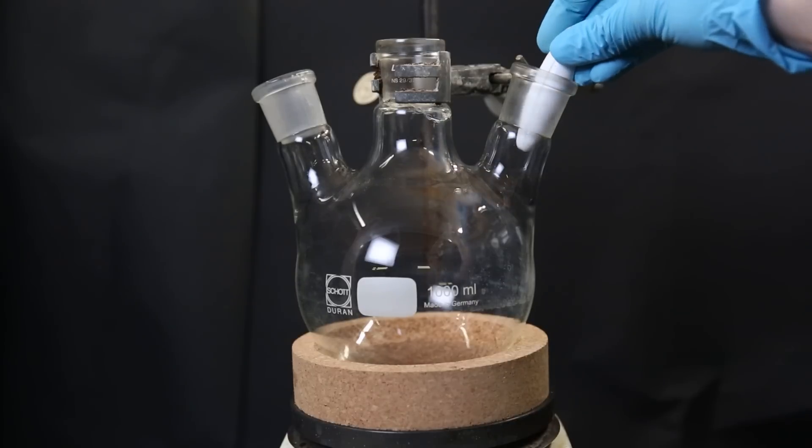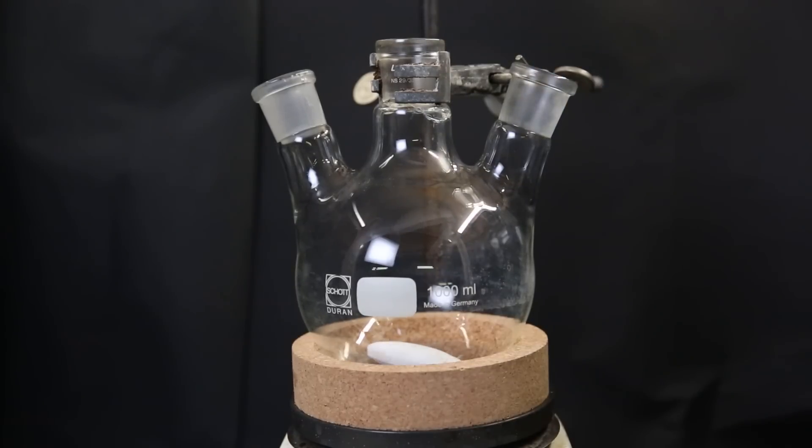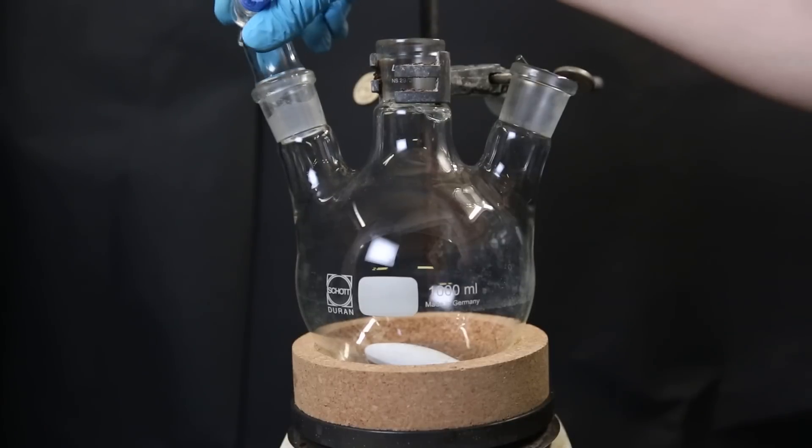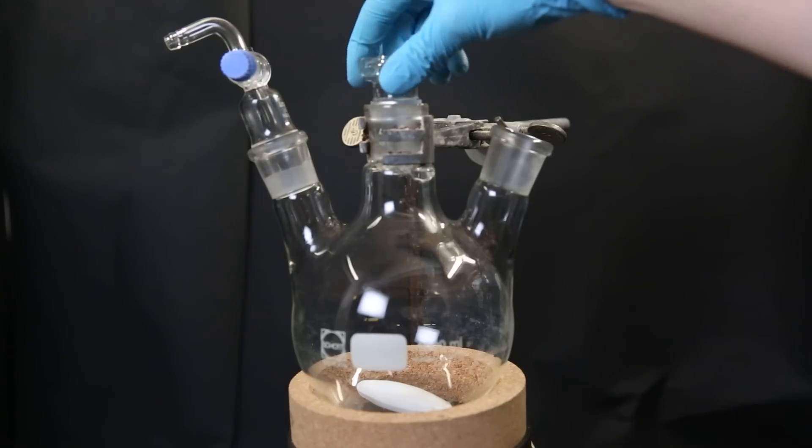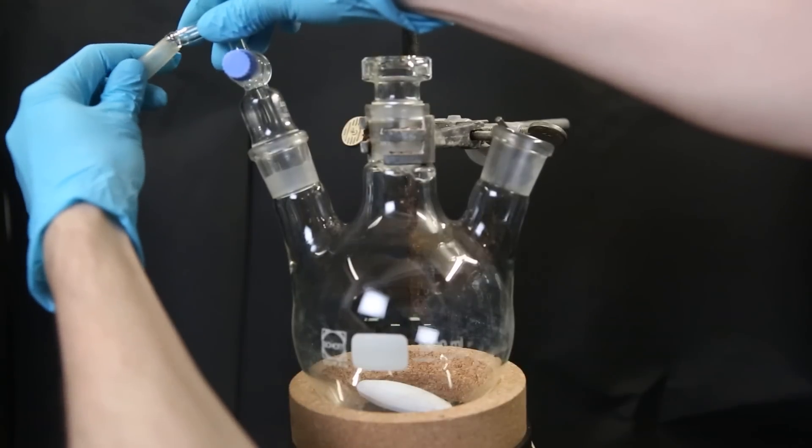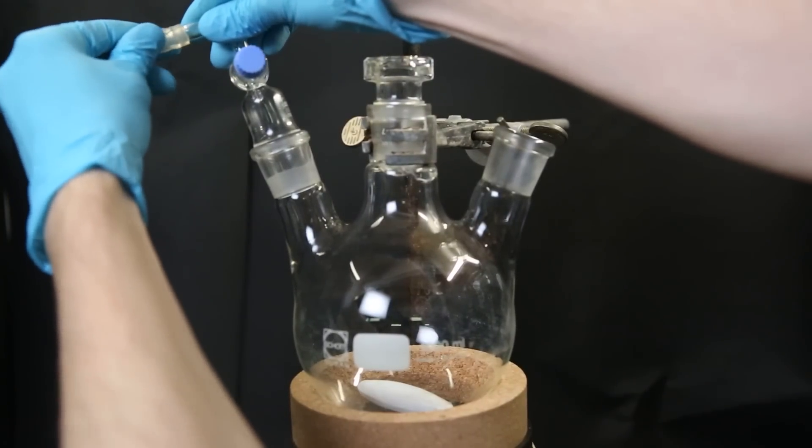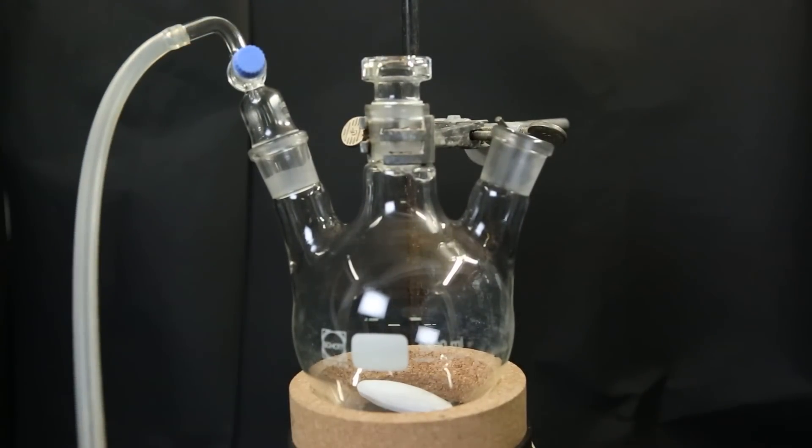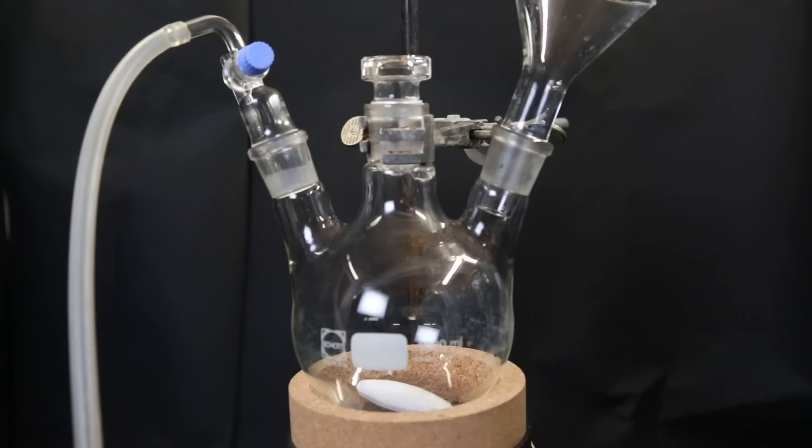To start off, I set up a large 1-liter 3-neck flask and add in a big stir bar. Then I attach a gas adapter and a stopper. I then connect an argon line to the gas adapter and let the argon flush the flask. Then under argon flow, I attach a funnel and add in 9 grams of paraformaldehyde.